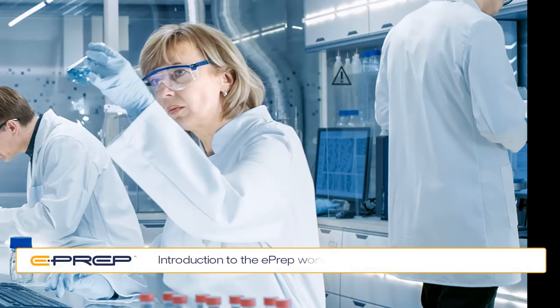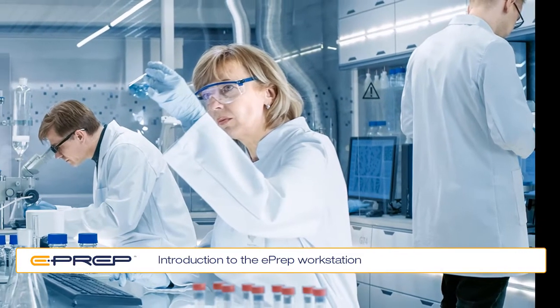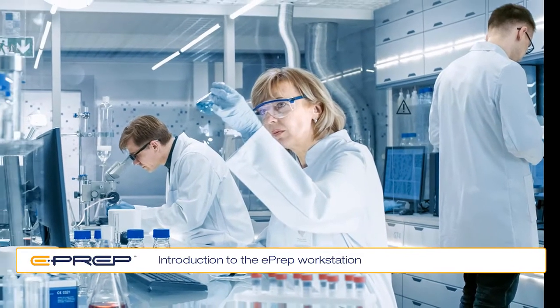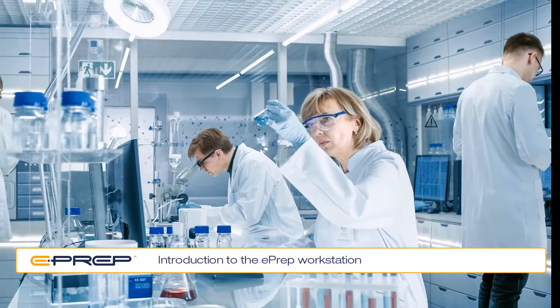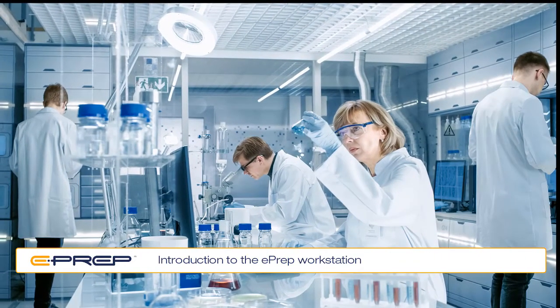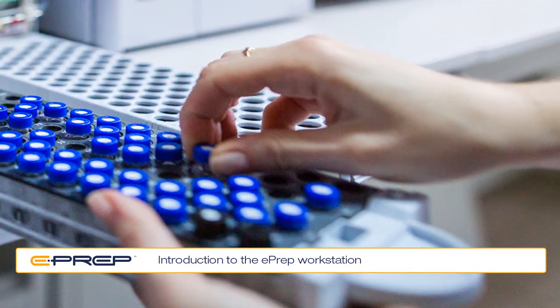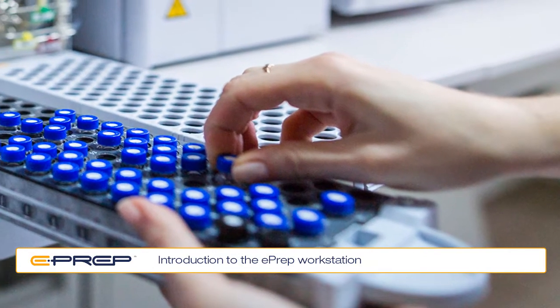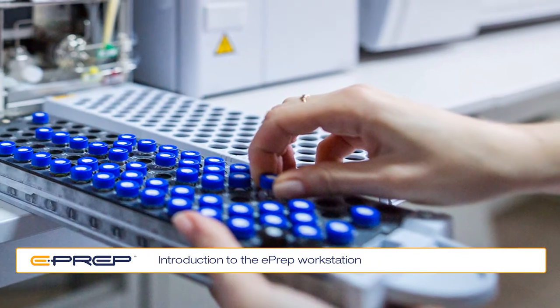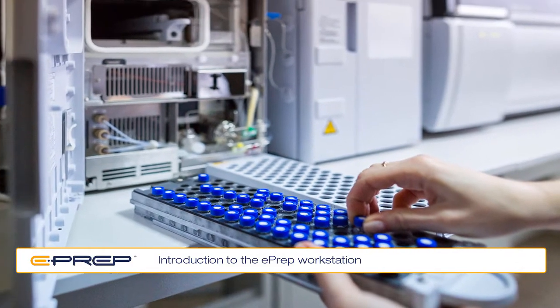Analytical sample and standards preparation are both done pretty much the same way now as when I started over 30 years ago. But when you think about it, the instruments, the software, and the autosamplers have all come such a long way, but getting the sample and standards to the instrument in a more efficient way hasn't really kept pace with other innovations. So when it comes to preparing our samples and standards, we need to be a bit smarter in the way we work.